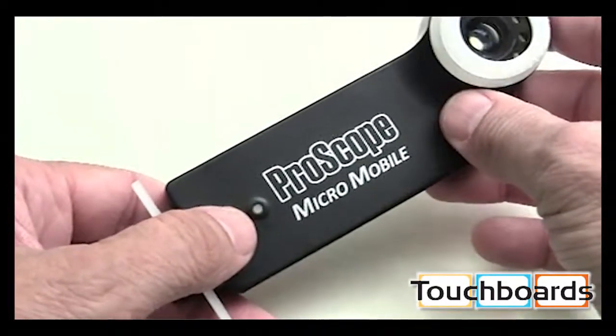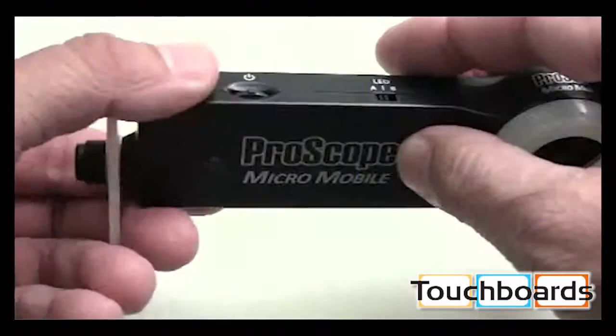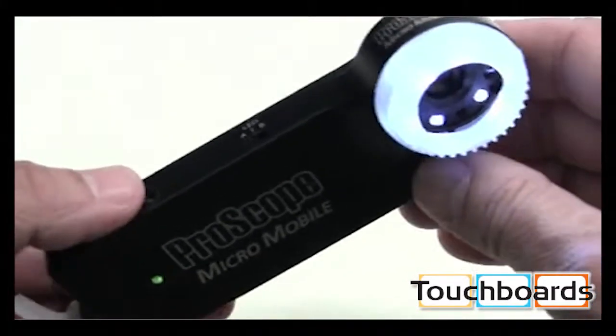This is a 5-hour lithium-ion polymer battery. The power button is recessed so that it's not accidentally pocket-powered. Press in on the power button for a full second until the power light comes on and the LEDs come on.